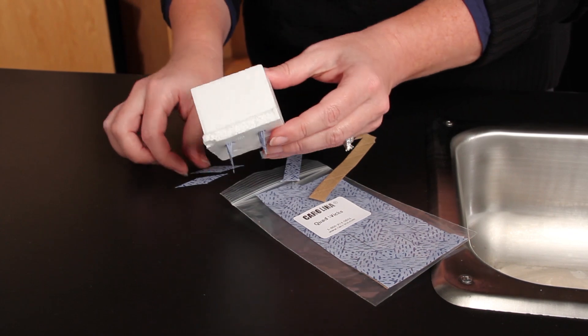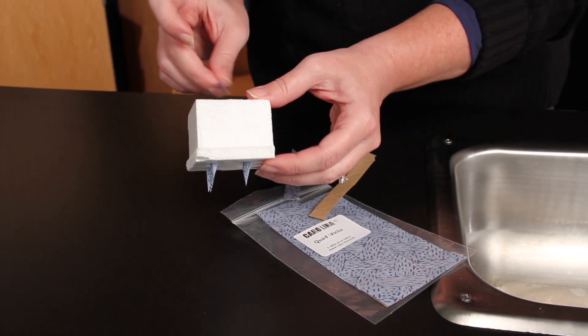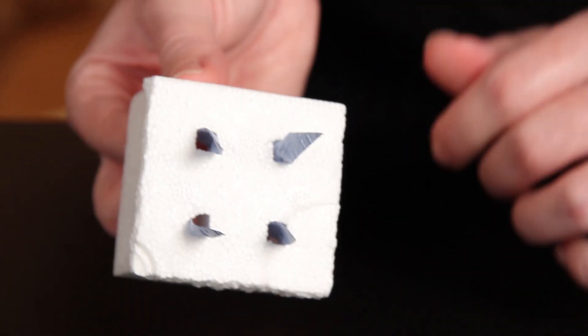Put a paper wick in each of the four cells. Pull the wick through the opening at the bottom of each cell, so the wick extends halfway out, approximately 2 centimeters.